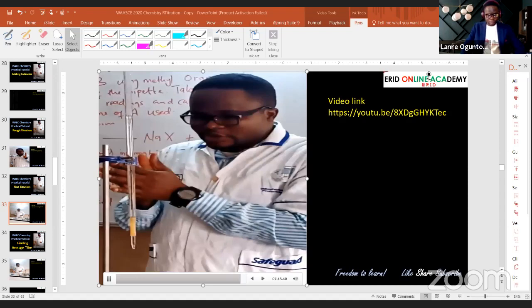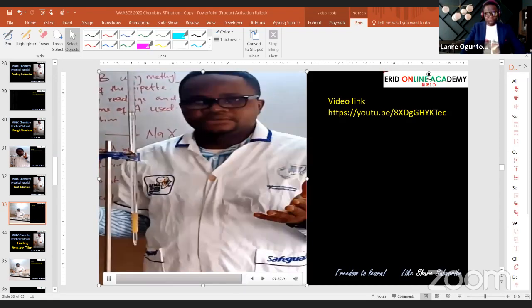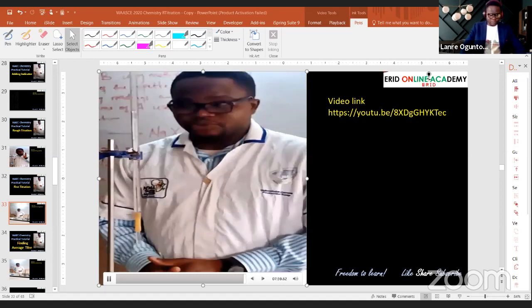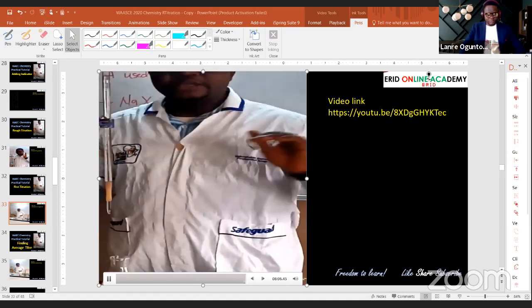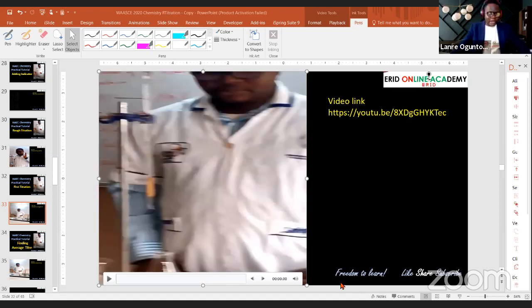So you are going to ensure that your second one should be like 25.4, or 25.3. So you repeat the same procedure as we did for this to do your second and your third titer. When you are done, you find the average of the values. So this is basically how to do your rough and your first, and of course you follow the same thing for your second and your third.